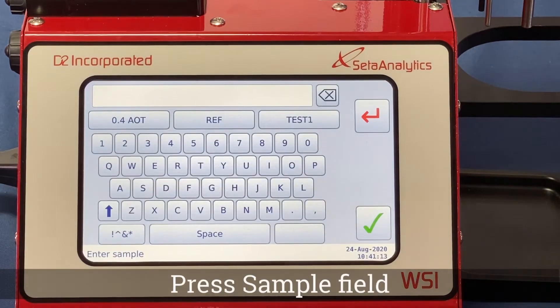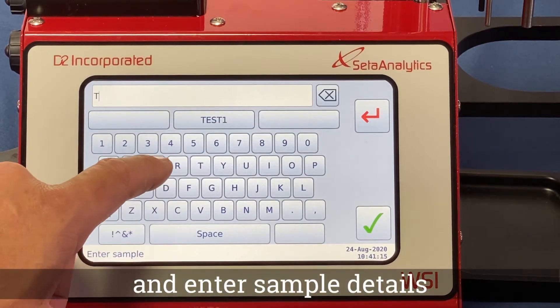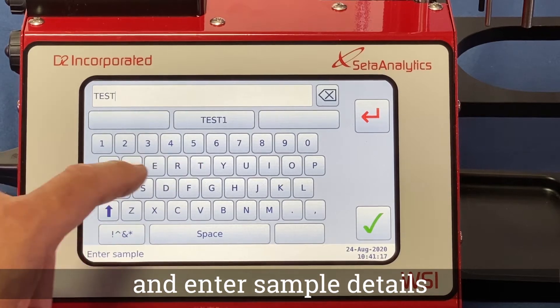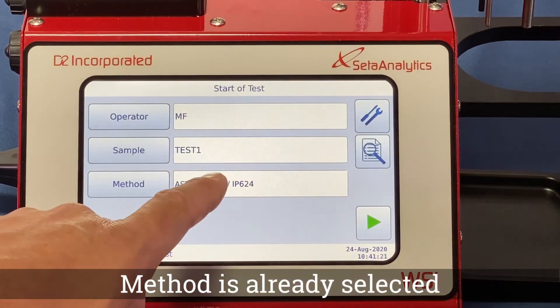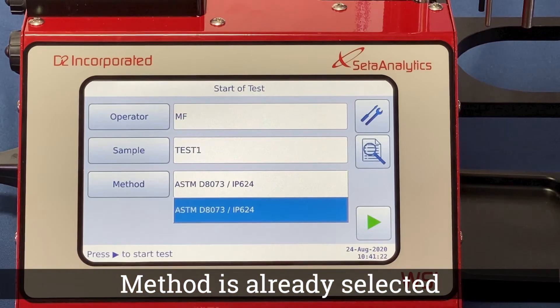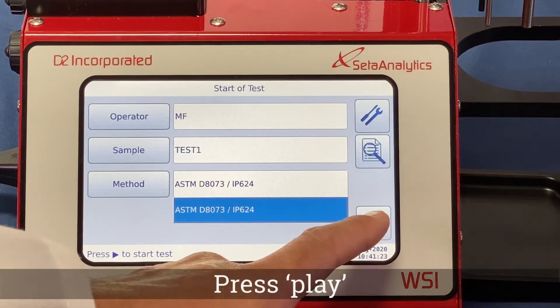Select the sample field and enter your sample details. Press the green tick box when complete. The method ASTM D8073 and IP624 is already pre-selected. Press the green arrow to proceed.